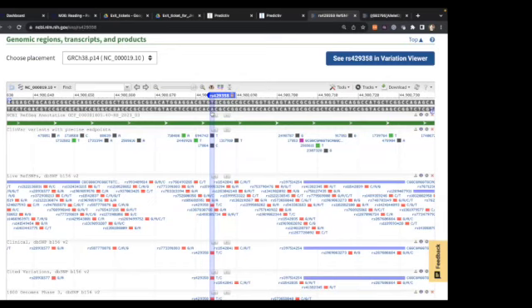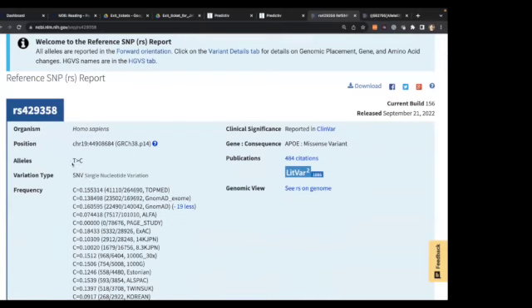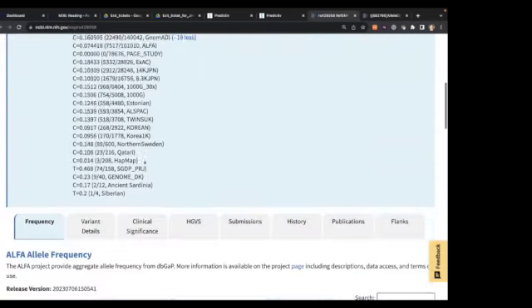For the case of BRCA1, which is located in the backward strand, you have to interpret it the other way. You first convert this T into the A. The reference sequence of the mRNA is A, and then your SNP allele is not C, but G. So it's an A to G mutation in the mRNA sequence. It's complicated, but you have to do that kind of step. Otherwise, the result won't make sense.